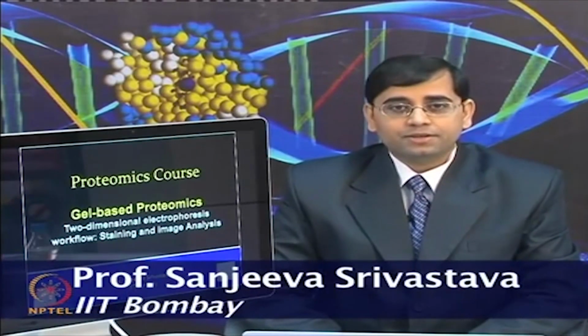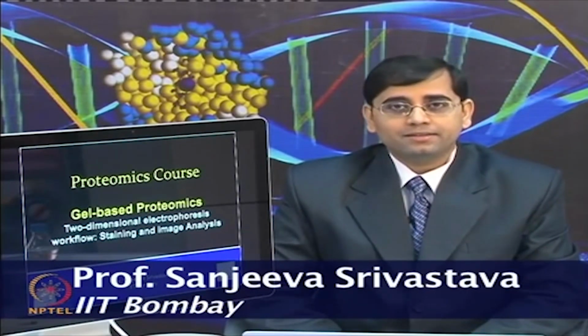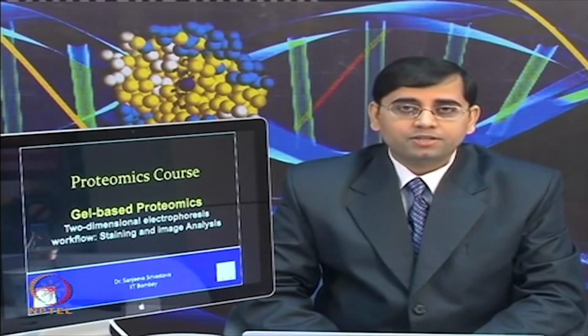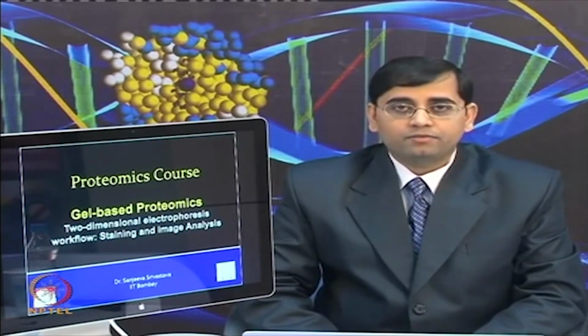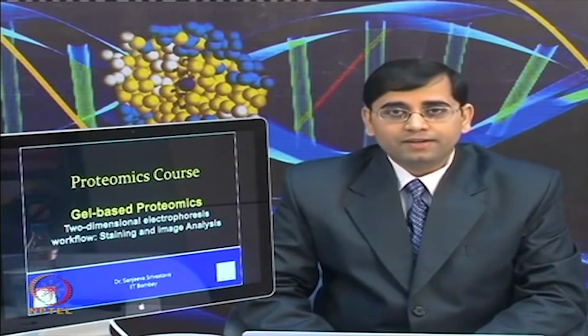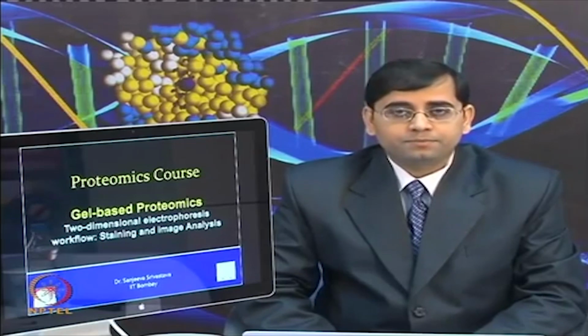So, welcome to the Proteomics course. In the last lecture, we started discussing gel based proteomics, how different techniques are used to separate proteins, the complex protein mixtures, and I mentioned that SDS PAGE, blue native PAGE, two-dimensional electrophoresis and various advanced forms of gel based proteomics, they all together help to study different types of problems by applying gel based approaches in proteomics.